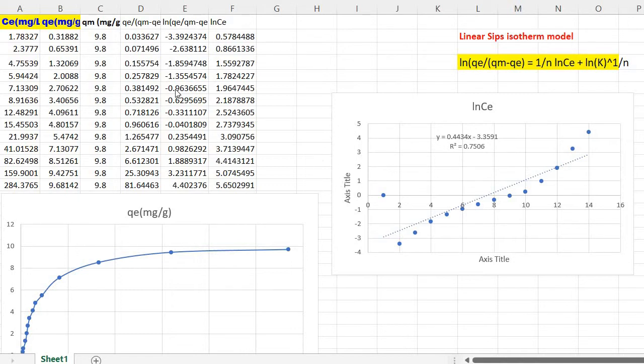So in order to fit, I have taken my data CE and QE. SIFS isotherm model can be written as ln QE divided by QM minus QE equal to 1 by N, ln CE plus ln K to the power 1 by N.